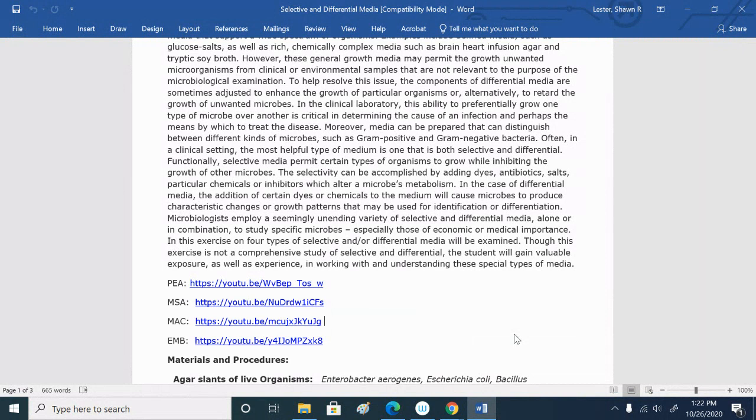And the ocean was 3%, right? And so the mannitol salt agar is 7.5%, so it's more than twice as salty as the ocean. That high salt inhibits a wide variety of bacteria, but it allows certain other bacteria to grow, right? They can tolerate the higher salt.